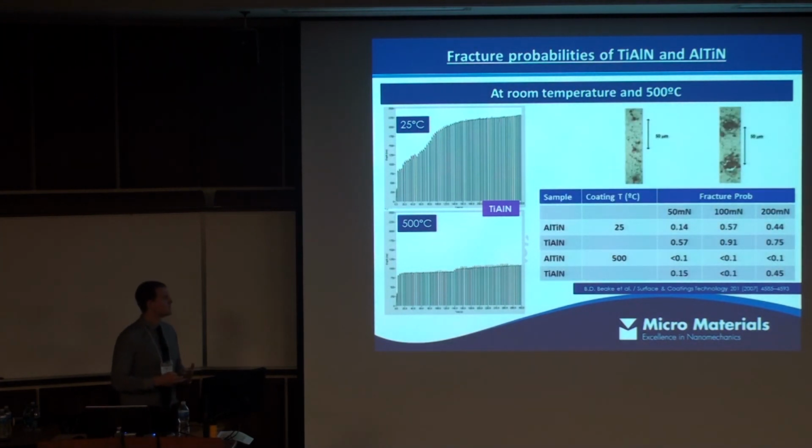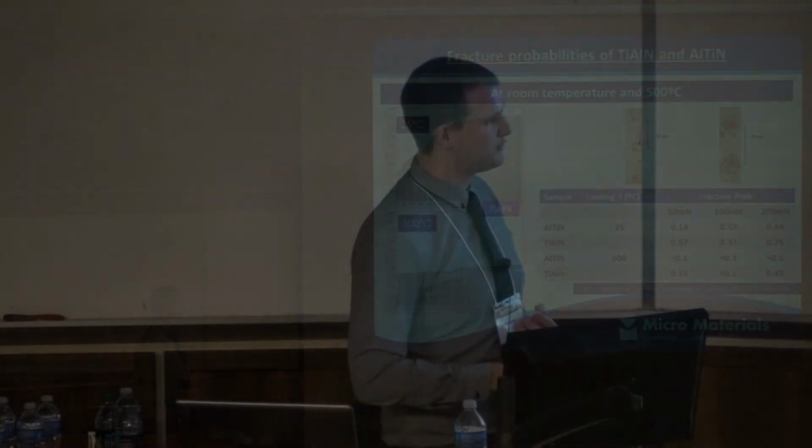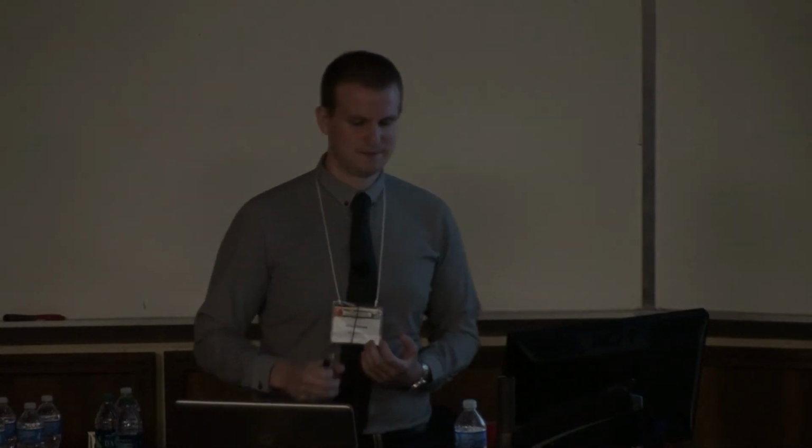So again, we can use this to compare different coatings. So we have a fracture probability for the two coatings at 25 and 500. And in both cases, you can see that actually at the increased temperature, the resistance to this kind of damage is much better.